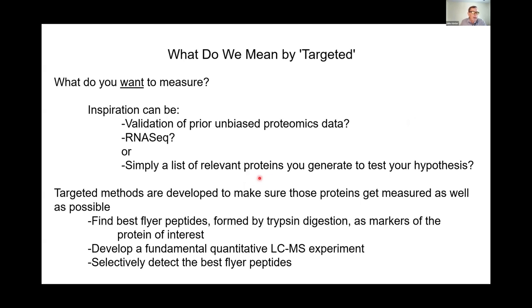More recently, we had a lab that wanted to measure a protein called APEX1 and its companion DNA damage enzymes, and we set that up for them. But these tend to be the two directions that experiments come to us.